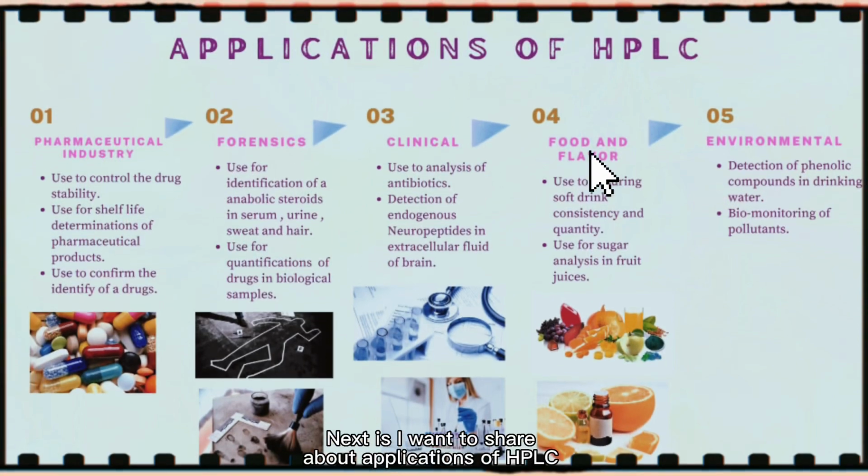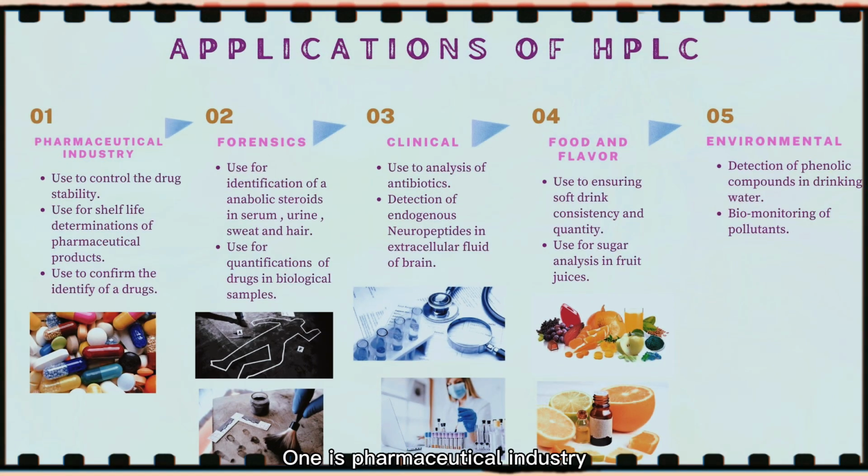Next, I want to share about applications of HPLC. One is the pharmaceutical industry: used to control drug stability, used for shelf life determinations of pharmaceutical products, and used to confirm the identity of drugs.